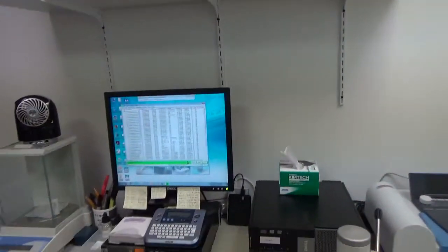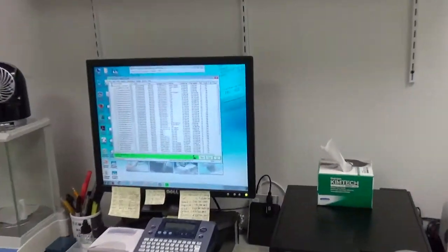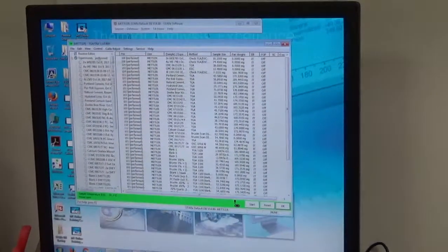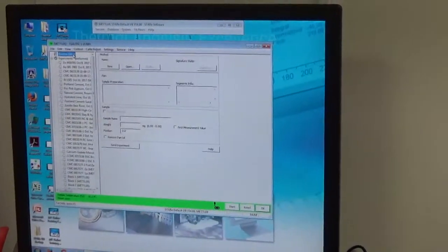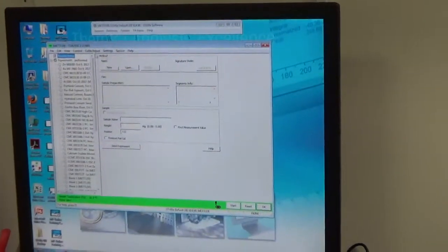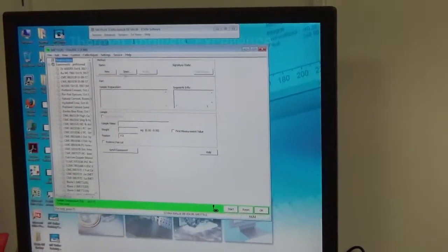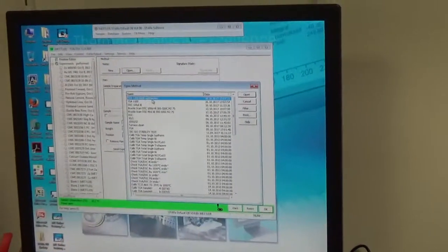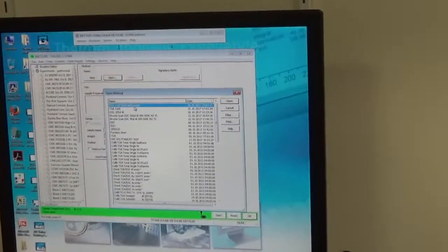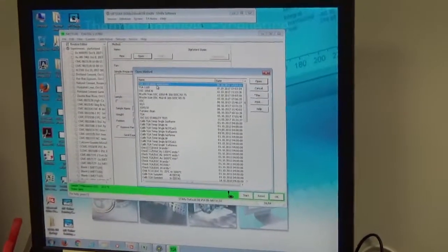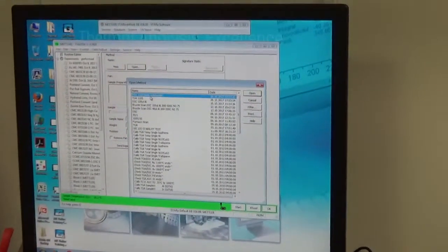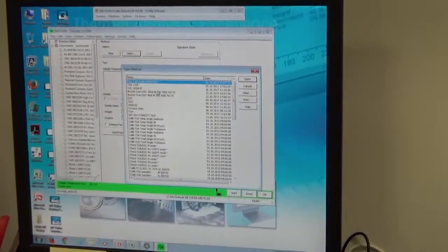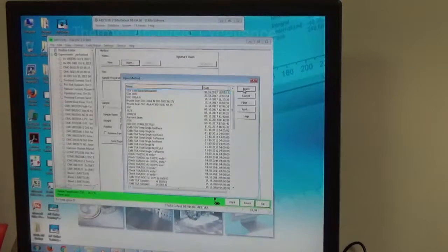There is a method — we set up a method to do the thermal analysis. Once you go to the routine editor, it shows the method. We are going to open our method: TGA1100 blank subtraction method. It already knows we ran a blank sample and subtracts the result of the blank sample against the actual sample.